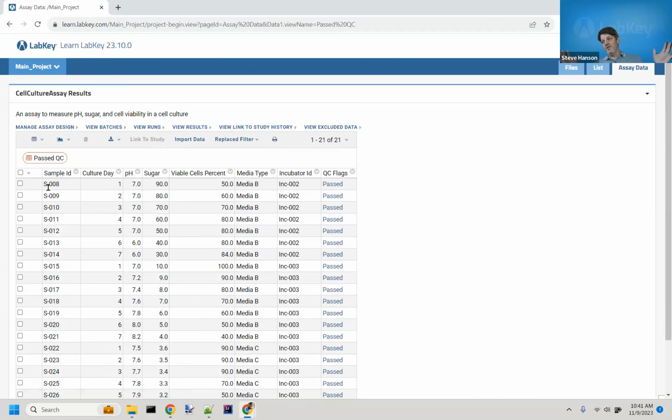Great, okay, that's what I wanted. Super, I've got a way to do it now. So I hope that answers your question. A lot of these features, you sort of have to do some work to make them really work well. And QC flags are definitely one of those kinds of features.